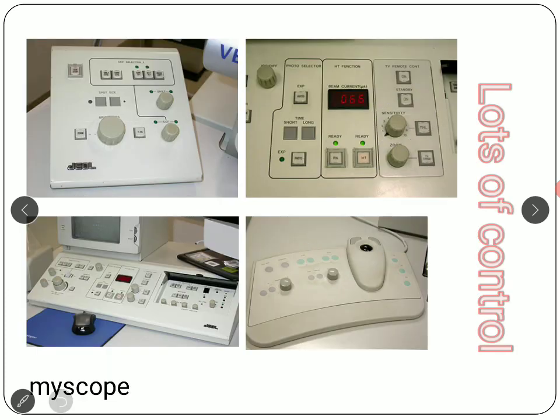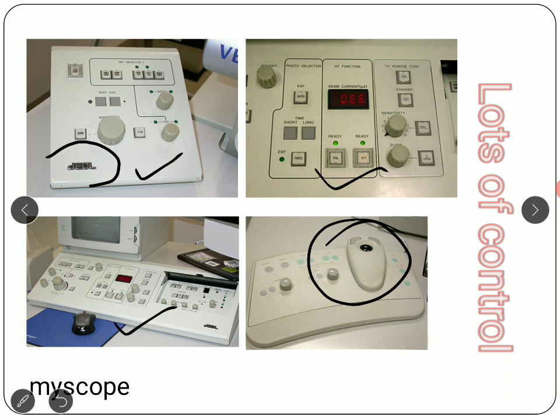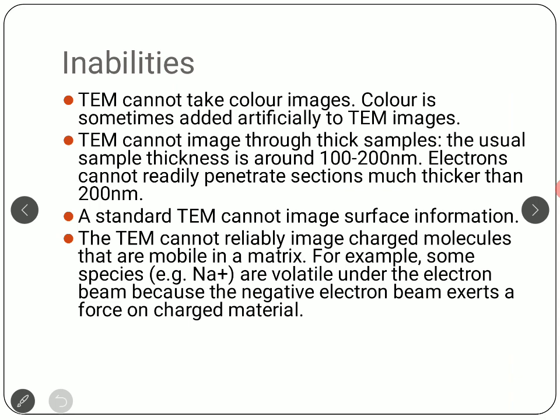And if you look into a real TEM instrument, there are lots of controls there. So you can adjust, and this basically works like a mouse. You can adjust the different positions, and then there are different setups. If you look into a typical TEM setup, you will see these kinds of controls that a professional who works on a TEM instrument will know all about. We're not going to go into the detail of this. This is a setup of a JEOL company, one of the prominent companies which produces TEM machines.